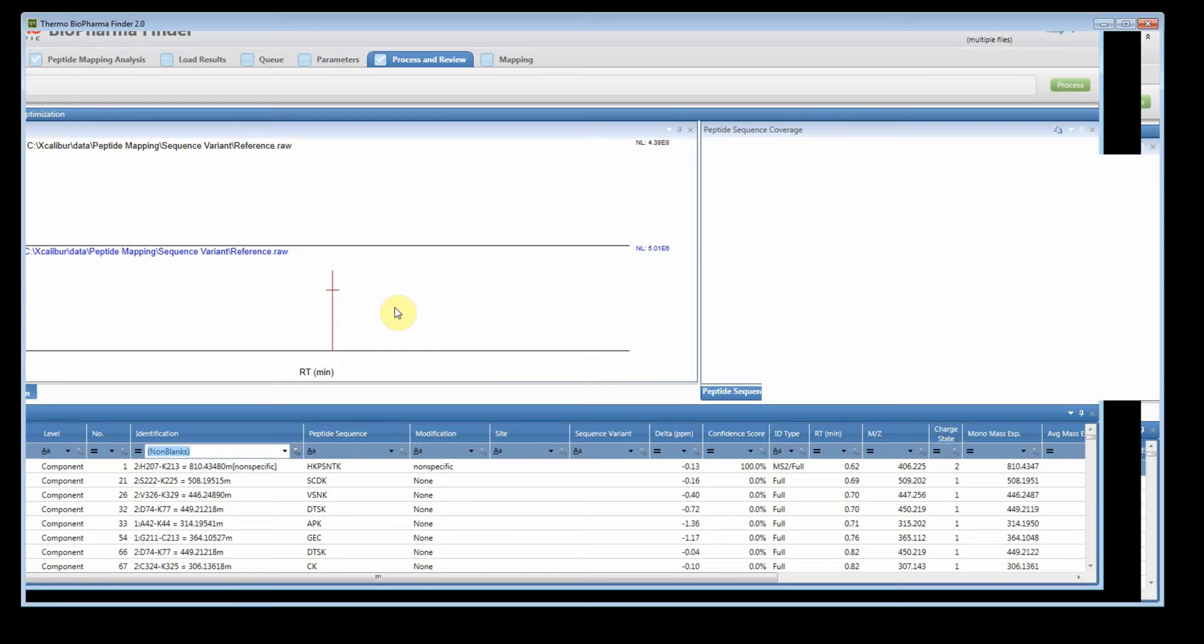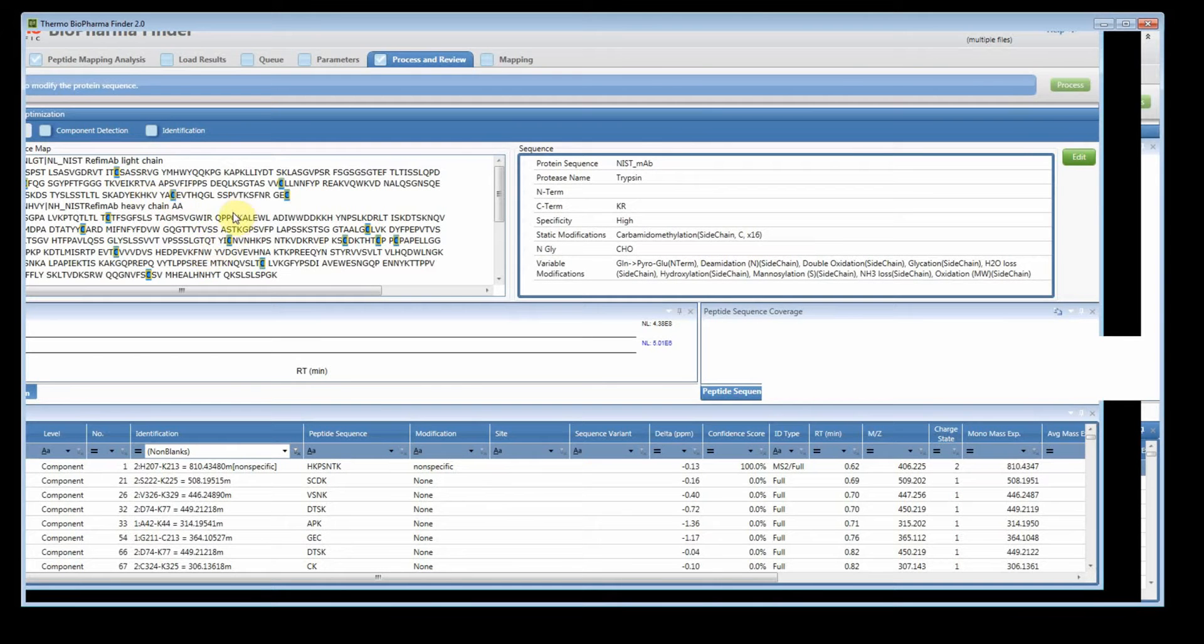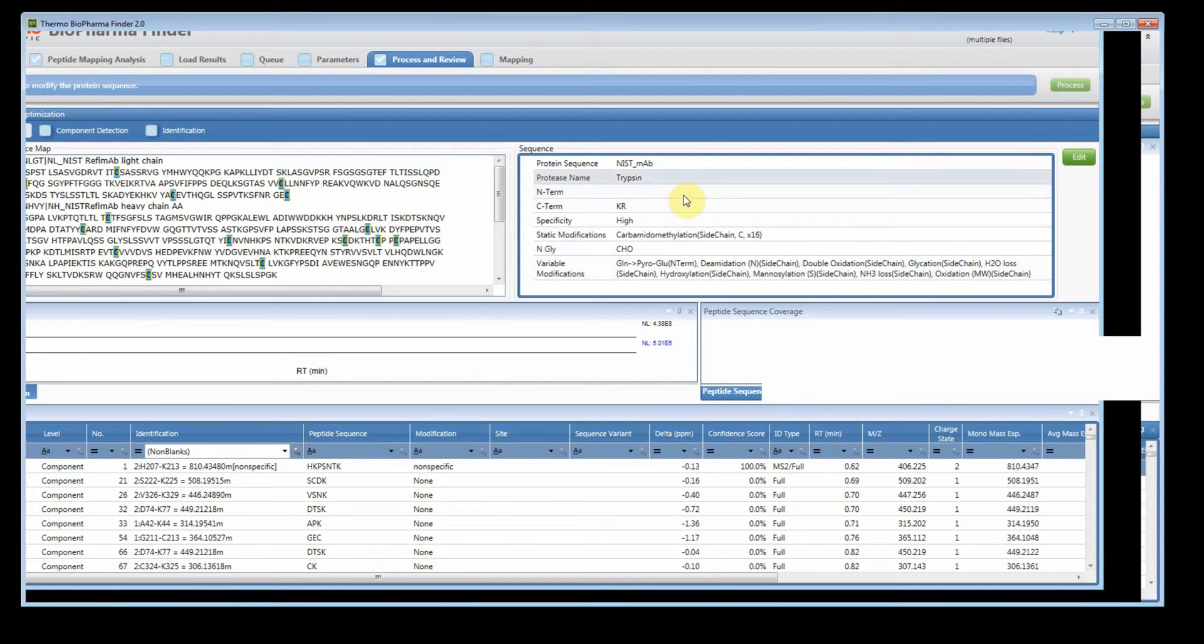So I processed the files using the peptide mapping and if you look at the real-time optimization you'll see my parameters. I have the light chain and the heavy chain. I added a static modification to the cysteine, as you can see here. Did an end glycan search with Cho, and I added the default variable modifications and this is a tryptic digest.